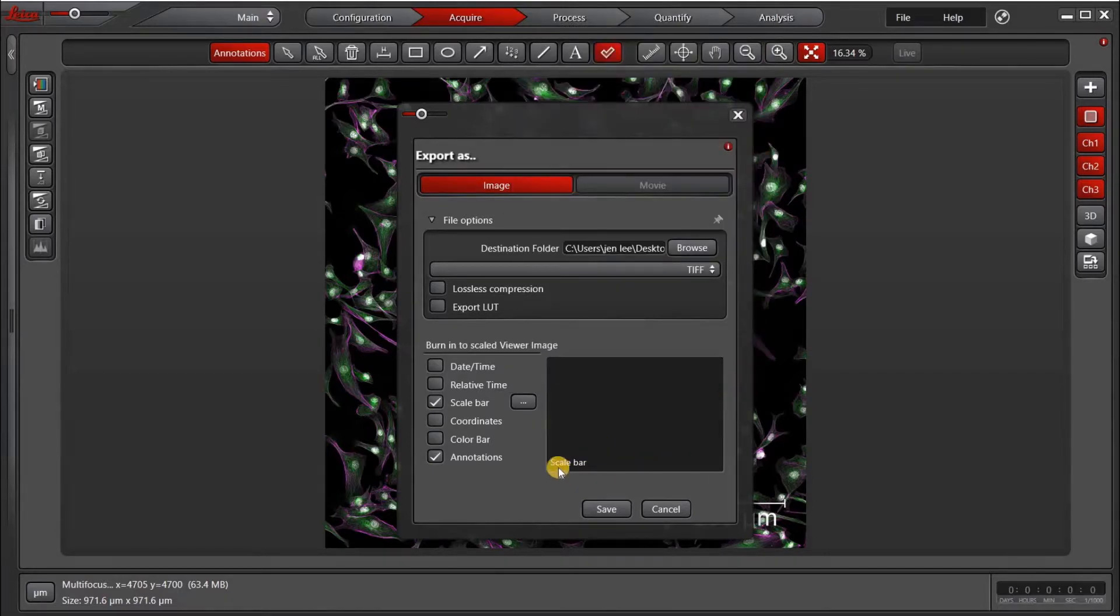Unfortunately, you do not get a preview of the scale bar before you export it, so that's why I'm going to show you both of them.